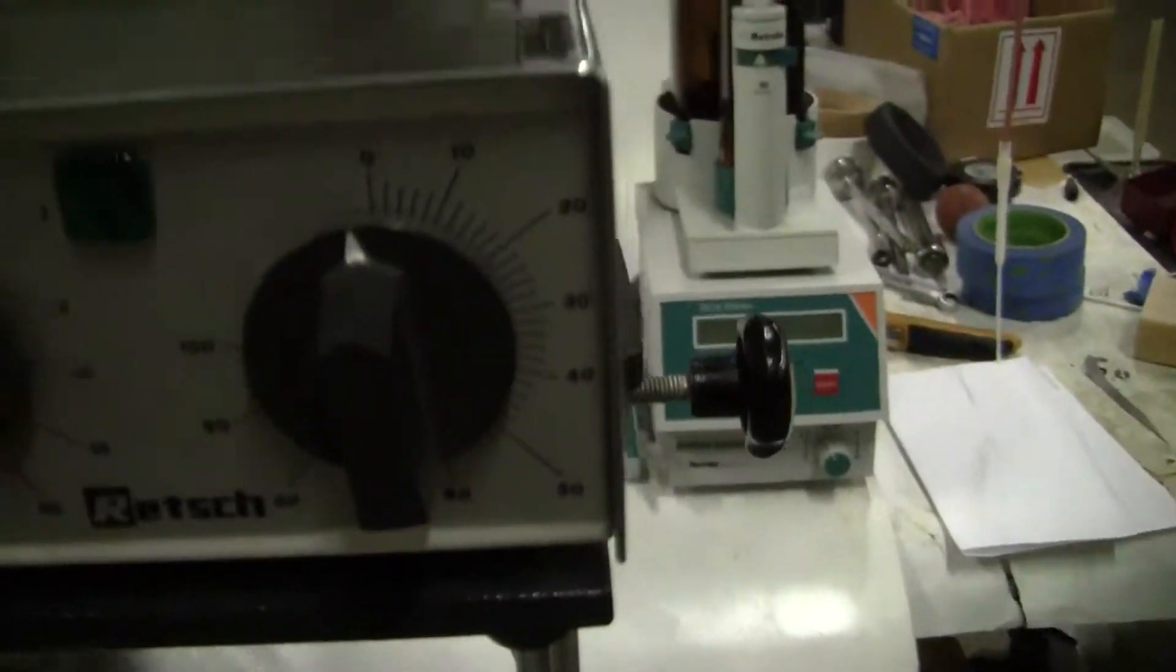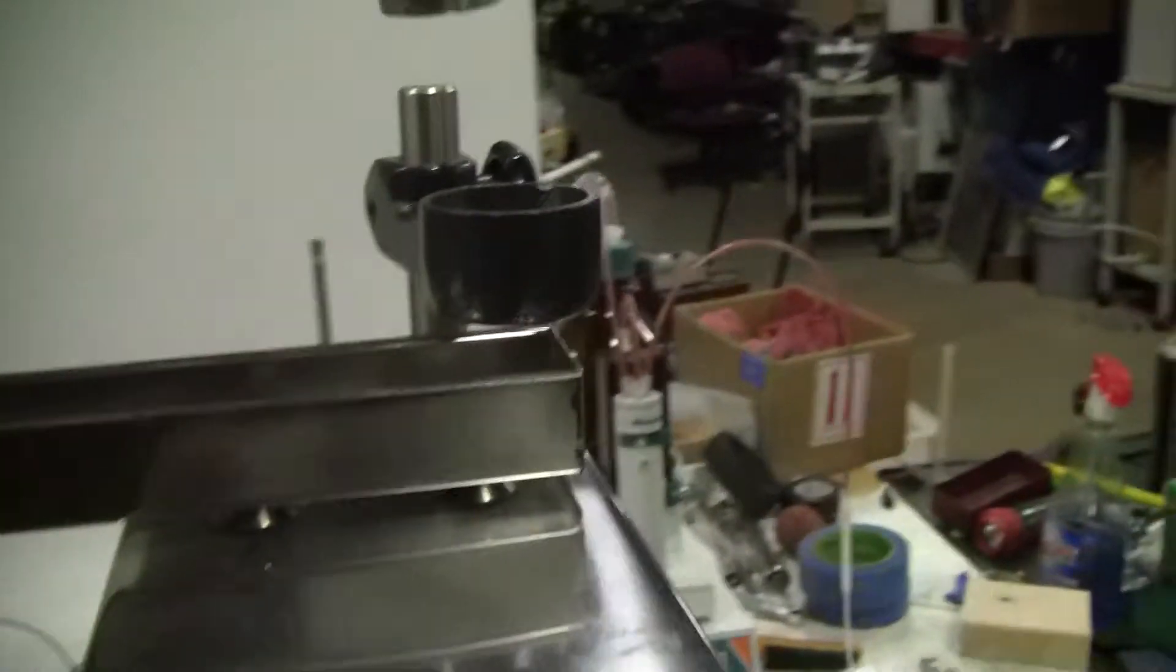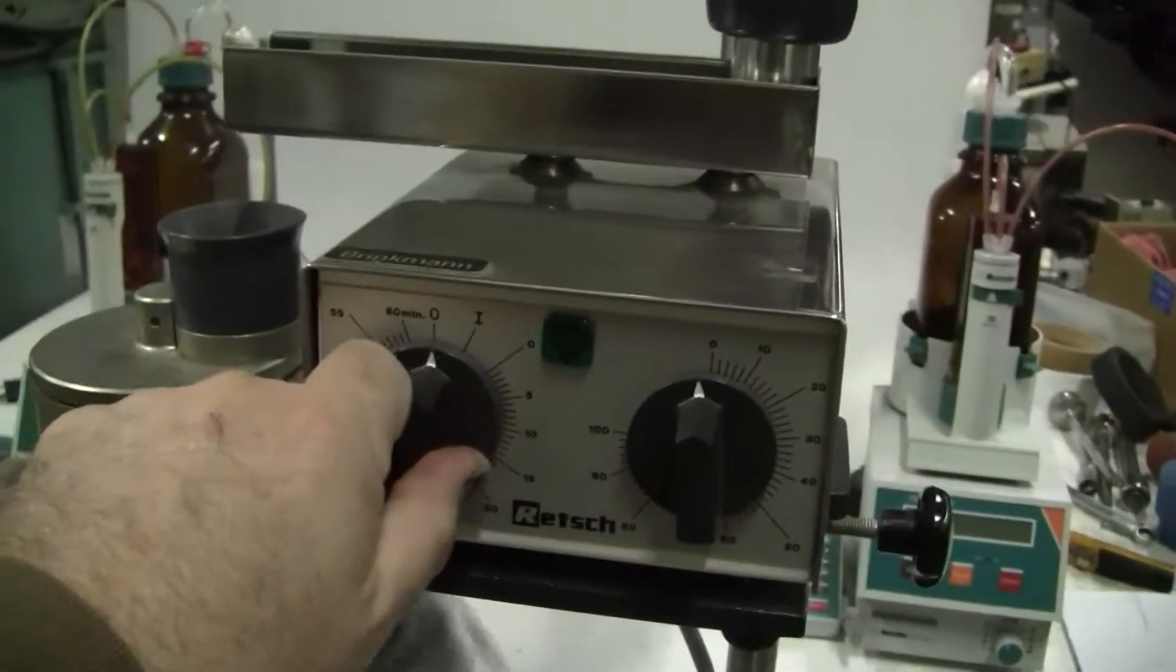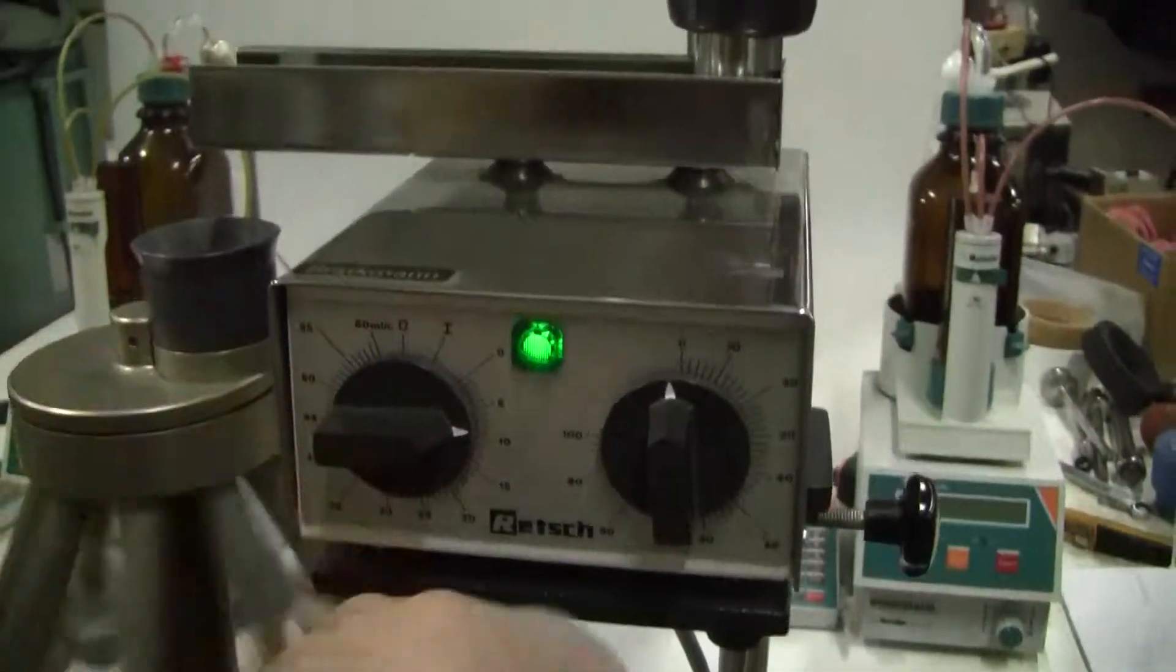Here's the top. Here's your feeder. Just a simple funnel. And you can also have a timer for the vibrator or run it continuously.